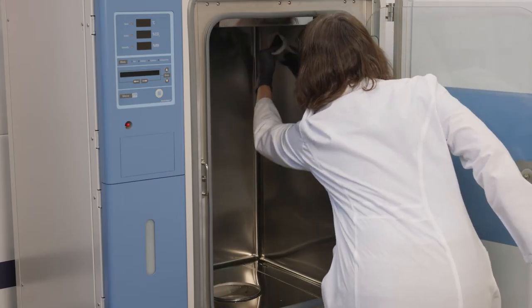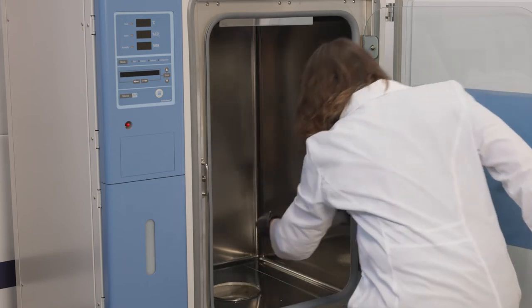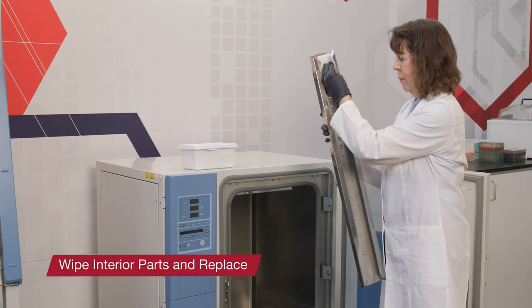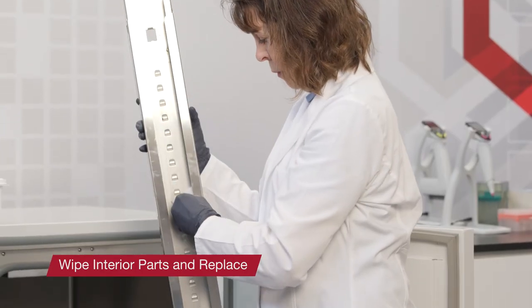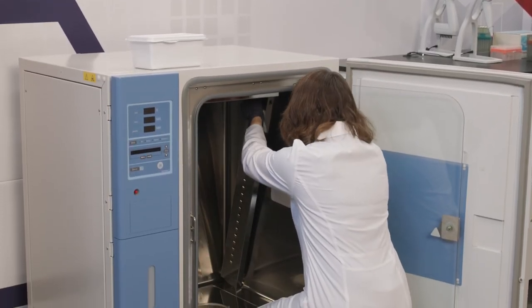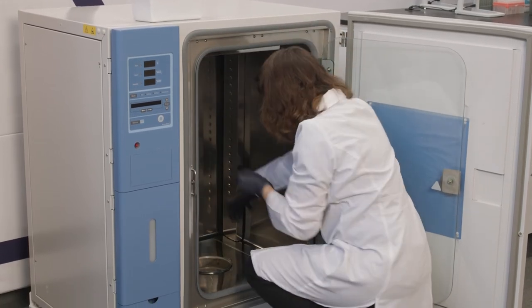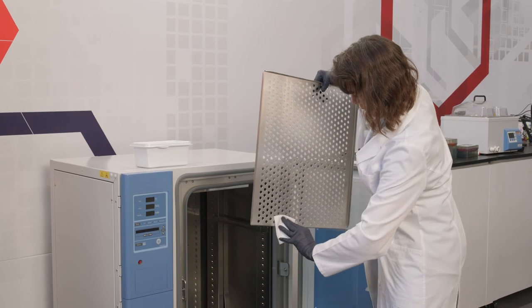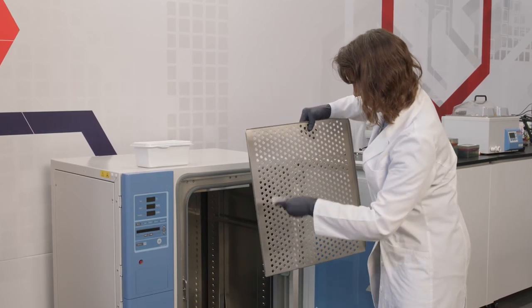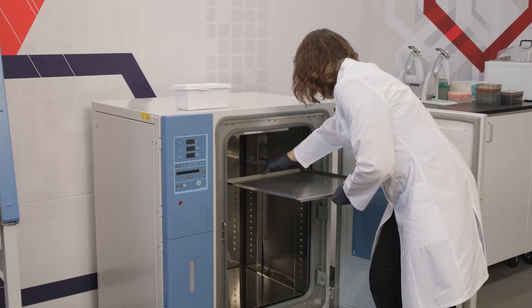If a disinfectant other than 70% ethanol or 70% isopropanol was used, repeat these steps with one of these disinfectants to remove any remaining residues. Starting with the back pilasters, carefully wipe each with a disinfectant. Allow the disinfectant to work for a few minutes, then follow with 70% ethanol or 70% isopropanol, then install the parts in the incubator chamber. Next, carefully wipe each shelf with a disinfectant. Allow the disinfectant to work for a few minutes, then follow with 70% ethanol or 70% isopropanol, then install the shelves in the incubator chamber.